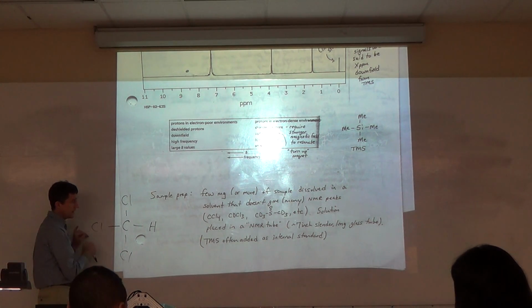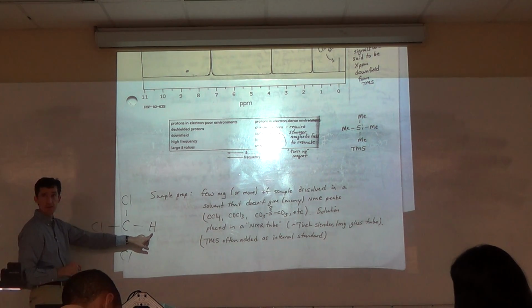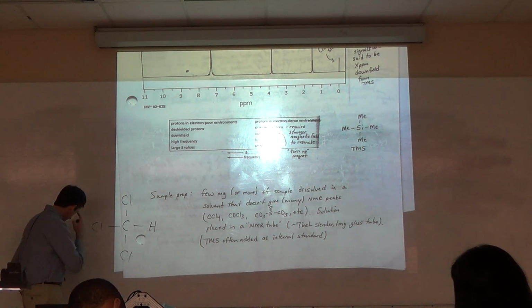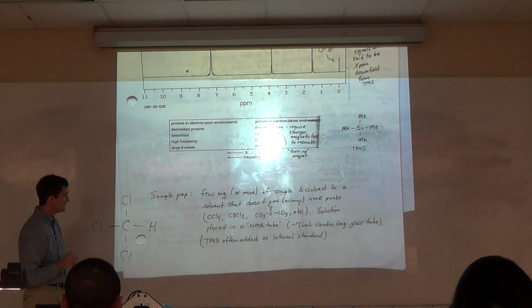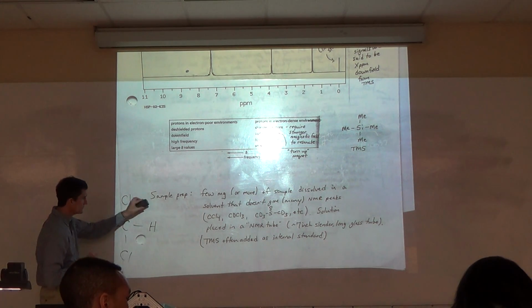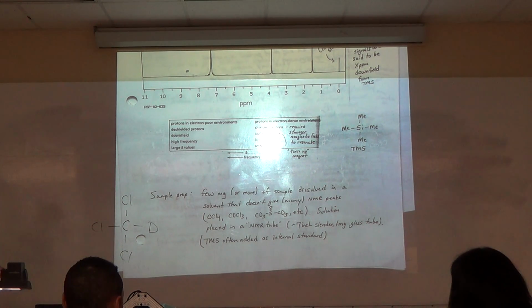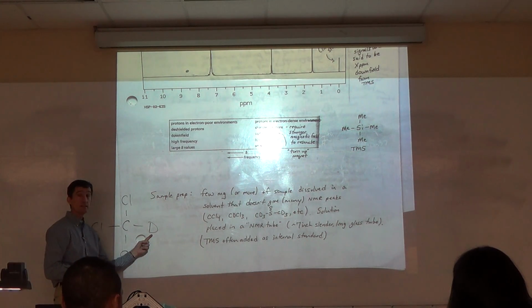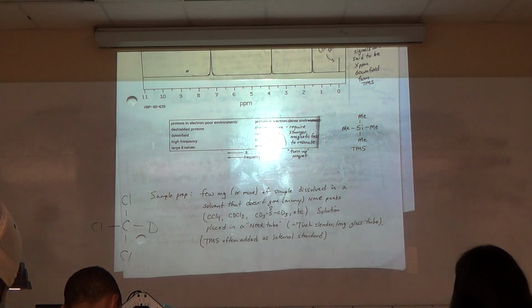Better solvent, but now we've got an H, and that would give a huge signal in the H NMR. And it turns out that's just not good. So chemists, wanting to always develop something new, have a tricky way to do this: replace the H with a D. We've used D a good bit in class, right? Just an isotope of hydrogen. D does not give an NMR signal in the proton NMR. So now we're good to go. It's still polar, but it doesn't give a signal.